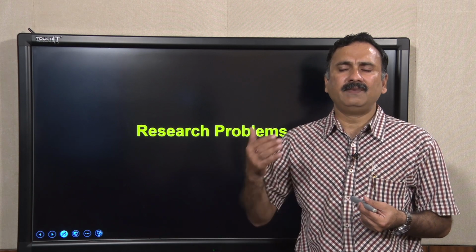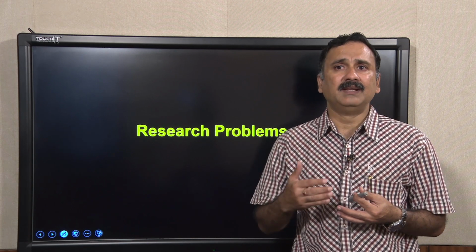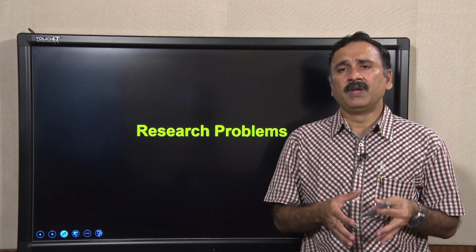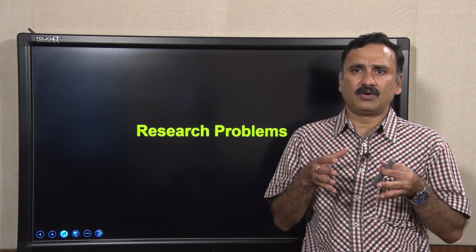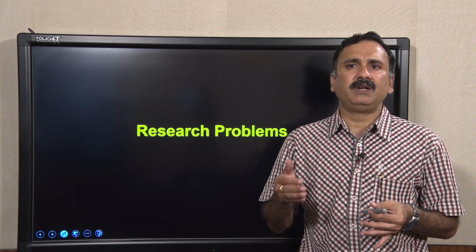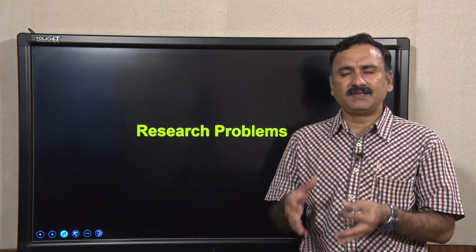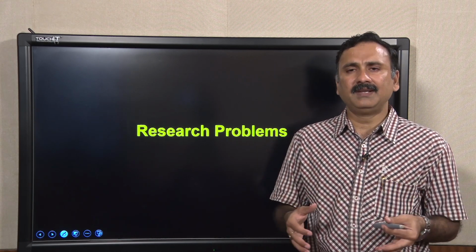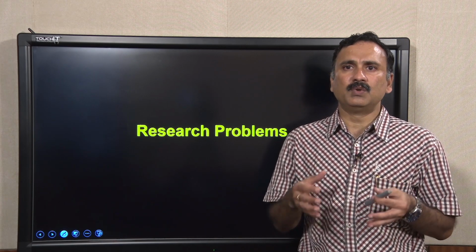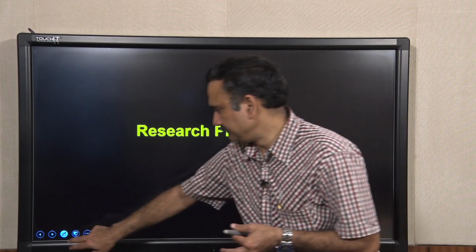The basic idea of discussing this problem is to emphasize that gel filtration chromatography is a very robust tool to answer many complicated questions, and performing it is easy. So, if you are interested, you can utilize gel filtration chromatography as one of the tools to answer these questions. So, let us start with the first question.